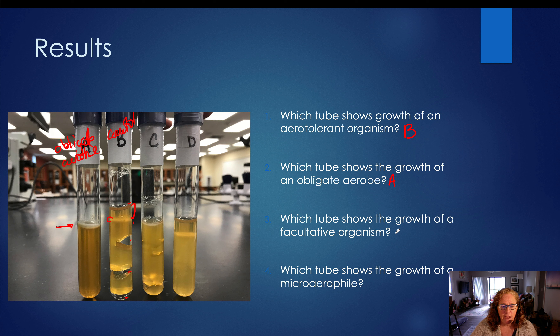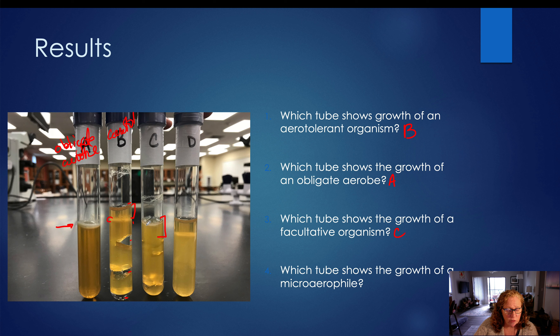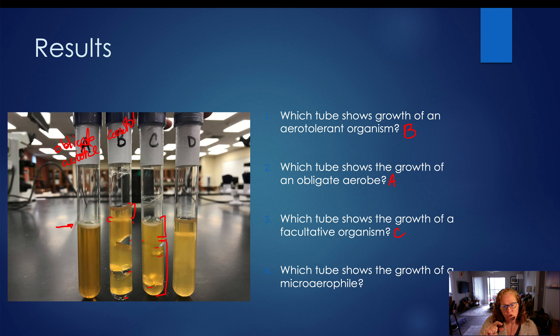Which tube shows the growth of a facultative organism? The answer is tube C. In tube C, we have lots of growth up at the top — a white film on the surface similar to our obligate aerobes, with dense cloudiness indicating cellular respiration occurring in high atmospheric oxygen. But when we get down to the lower part of the tube, we don't have enough oxygen. You can see bubbles starting to pop up and cracks in the agar from CO2 buildup, indicating fermentation. So we have cellular respiration at the top and anaerobic metabolism at the bottom — that's a facultative organism, capable of both forms of metabolism.